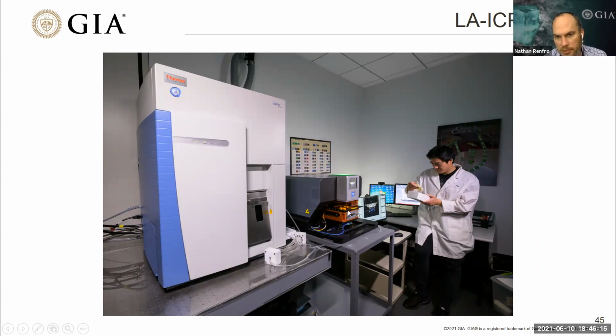We put our samples in the sample chamber and use a laser to ablate a very small portion of that stone. The ablation spot size is about 55 microns or so. Then there's a carrier gas that takes that ionized ablated material and carries it over here to the detector as it travels through a plasma torch. And then we basically measure the concentration of ions that is ablated from the host material. That can measure the bulk composition of the stone and also the trace elements.